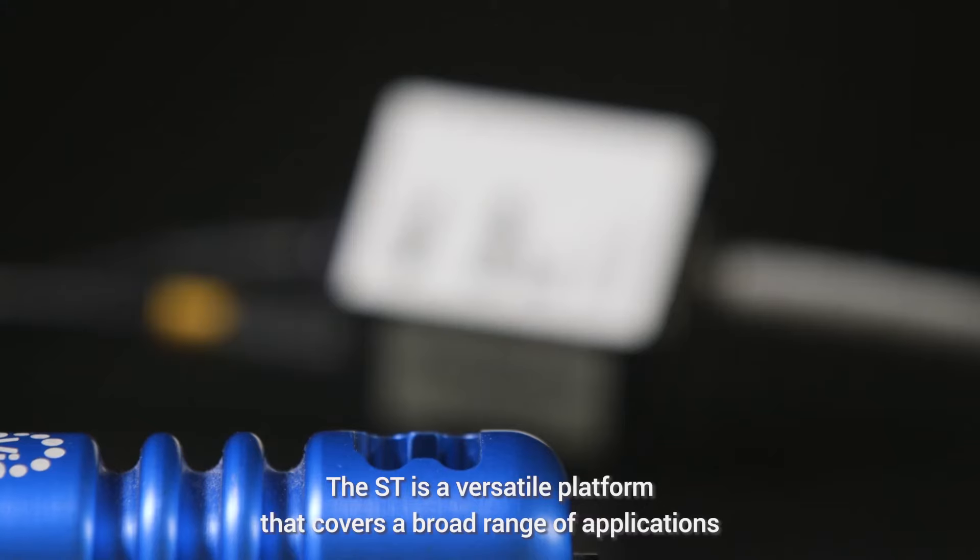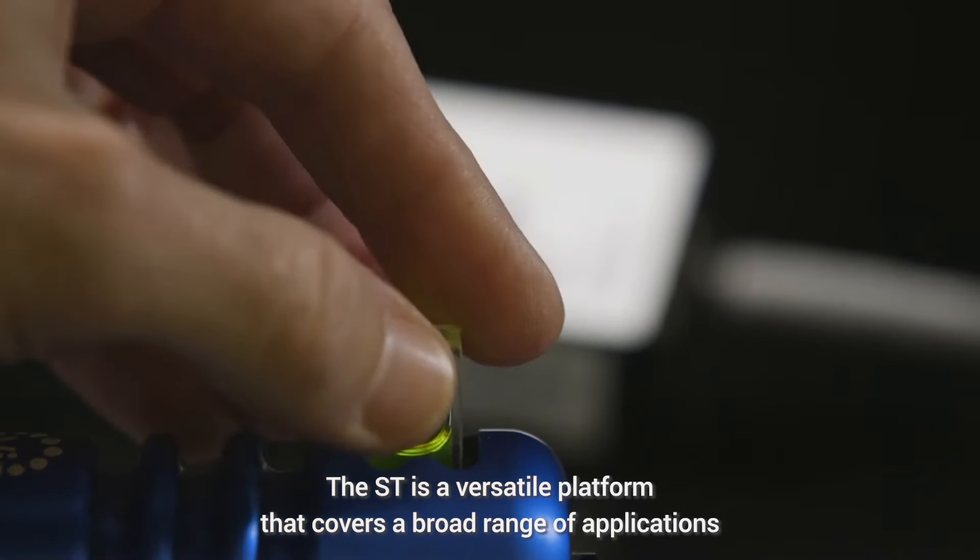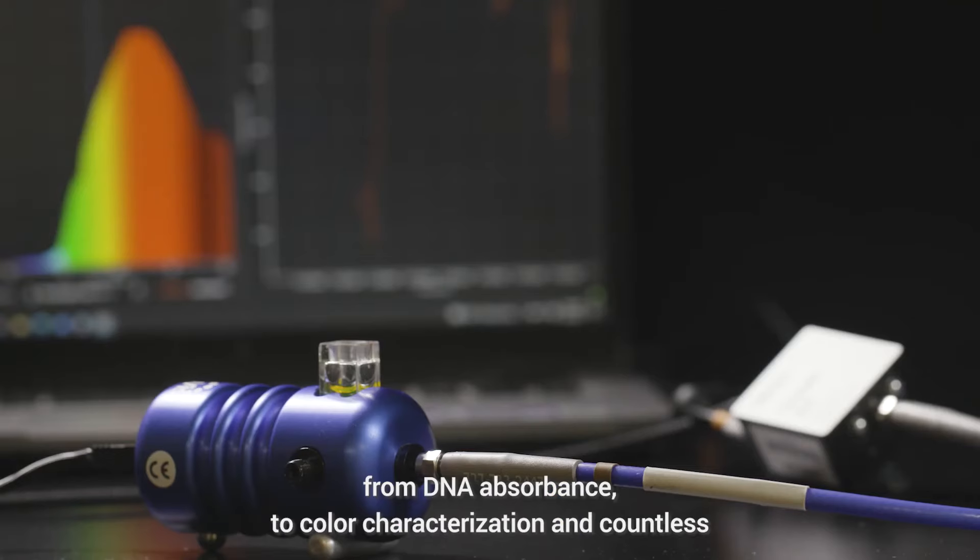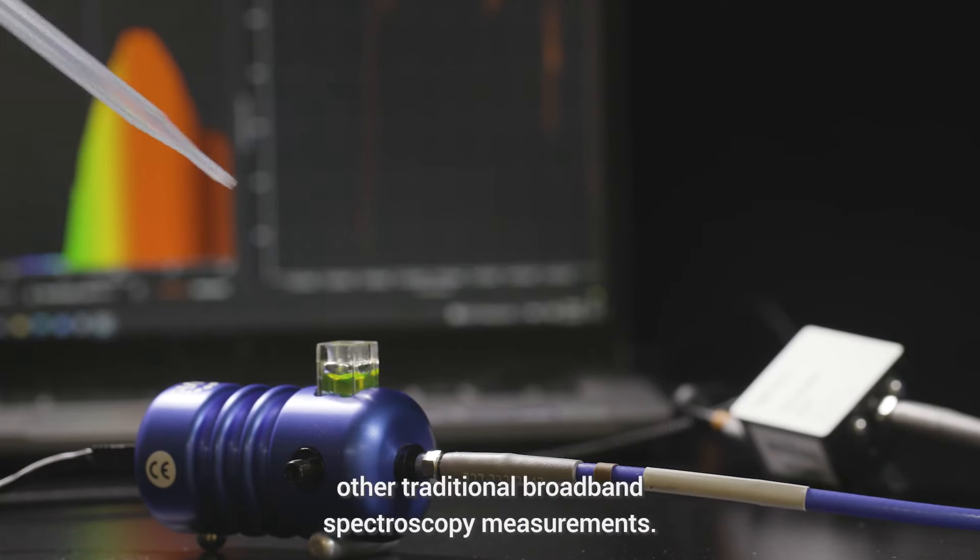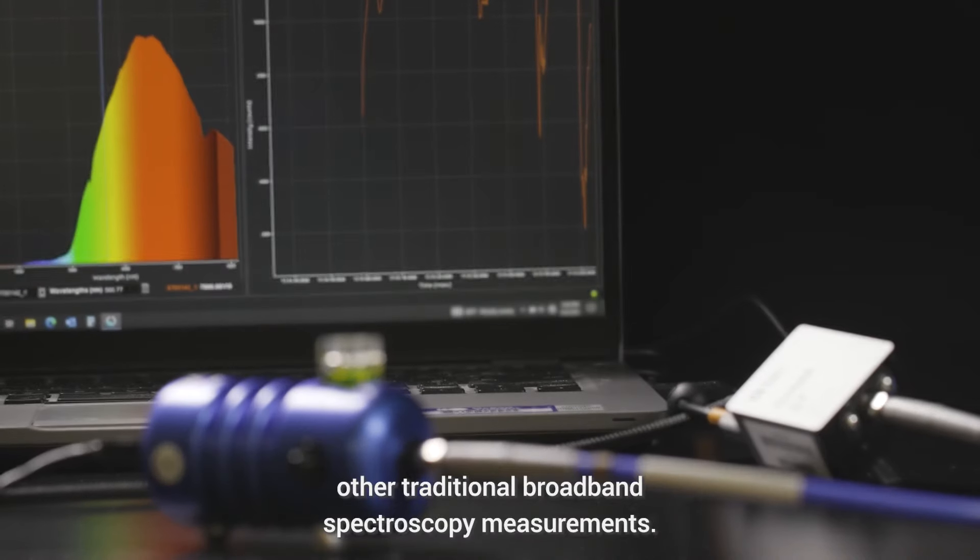The ST is a versatile platform that covers a broad range of applications, from DNA absorbance to color characterization and countless other traditional broadband spectroscopy measurements.